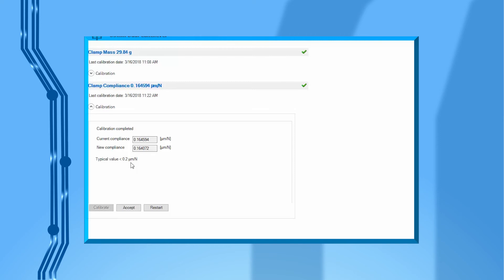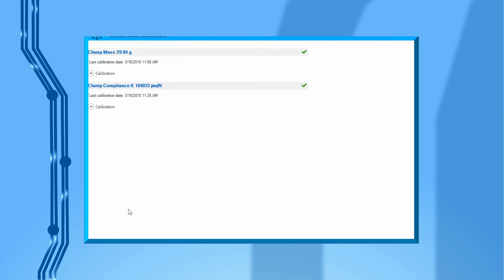When all calibrations have been completed, you should see green check marks on each calibration step. Then close this page in TRIO. You are now ready to use this clamp.